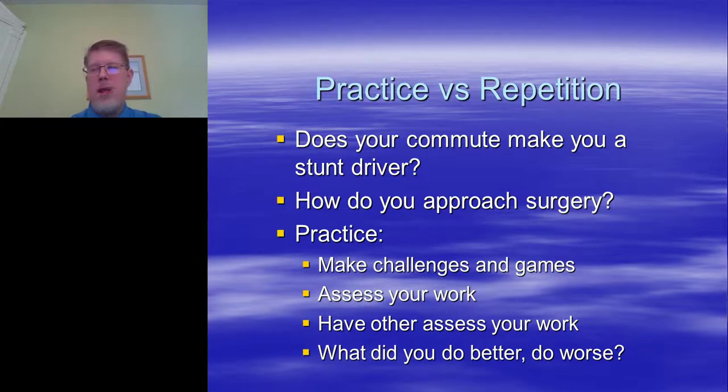Many ways you can do it. Set yourself little challenges. Can I work with an incision that is a centimeter smaller, which is better for the tissue integrity? Am I following my cases? Every animal that I do surgery on, I keep tabs on it for the life of that animal, because especially with device work, you can be without complications for months and then have a problem arise. And at that point, if you're not observing your animals, you'll never know.